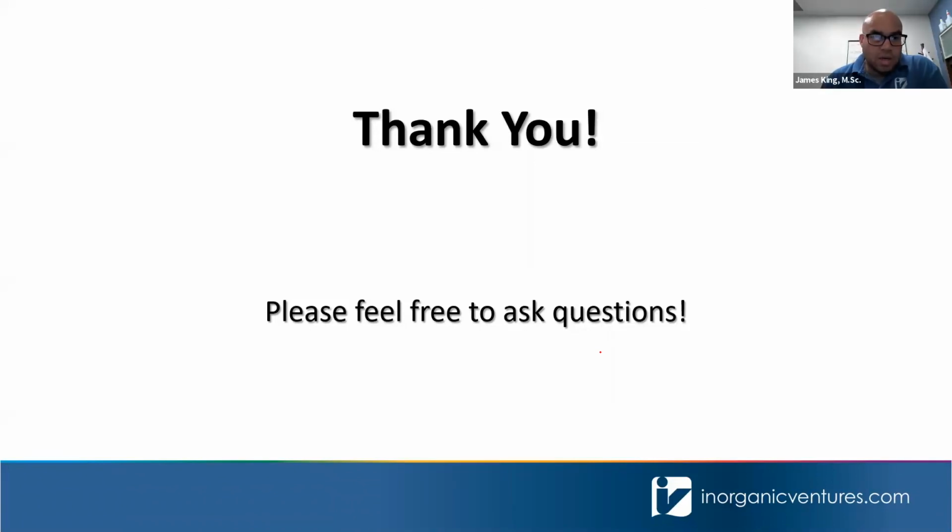All right. Thanks, guys. Good question. Great answers. All right. So we're going to move along here. And Christian looks like he's working with samples of geothermal waters and would like to ask about solving interferences in these samples. He follows up and says the main problem is that he's trying to measure low concentrations of aluminum and magnesium and high concentrations of sodium in the same sample. Can you guys comment on that?